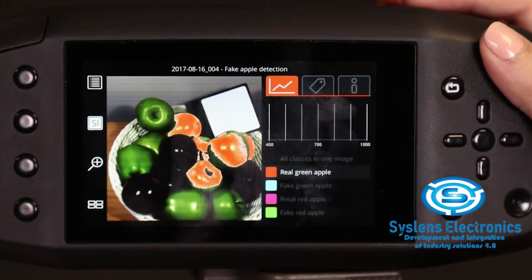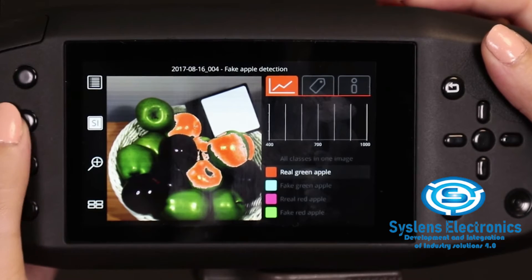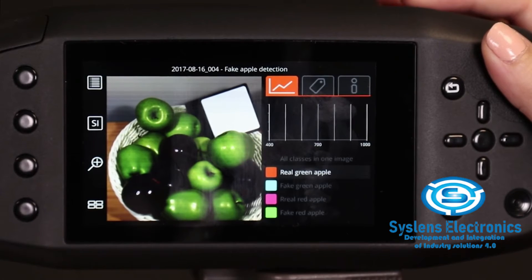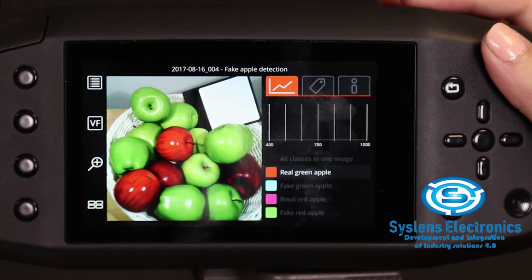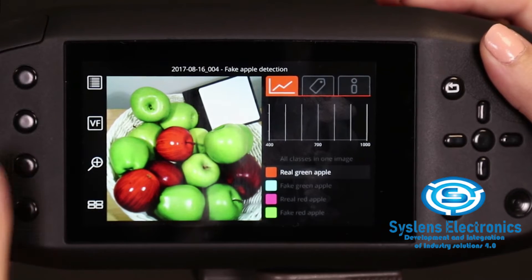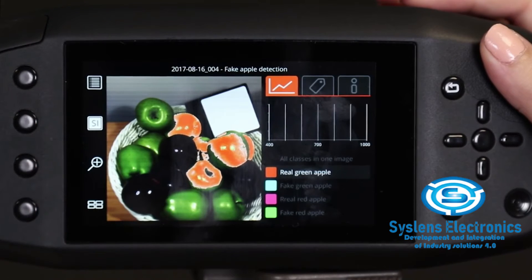With the custom 2 button, we can toggle between different results and backgrounds. As a default, we can see the class mask over the spectral image. Pressing custom 2, the class masks are removed and we can see only the spectral image. Pressing custom 2 again will show us the viewfinder color image, and a fourth press shows only the class mask on top of a black background. Further presses will start to visualize these results in the same order all over again.